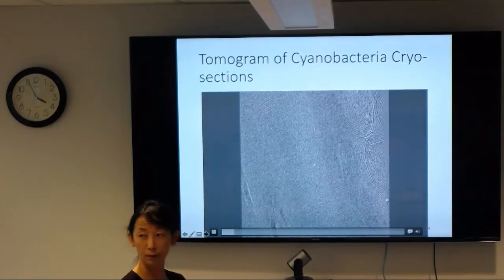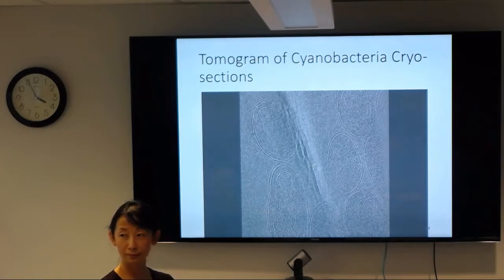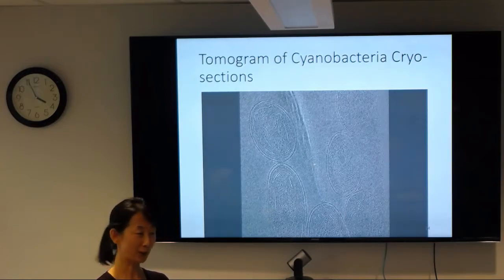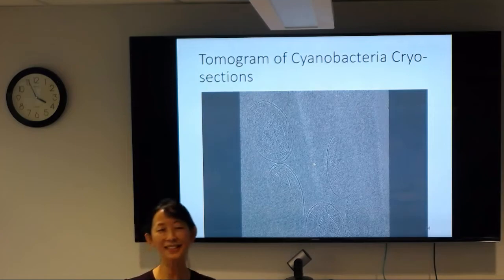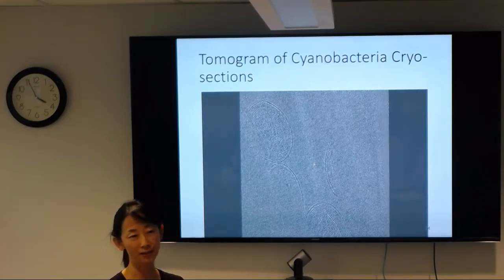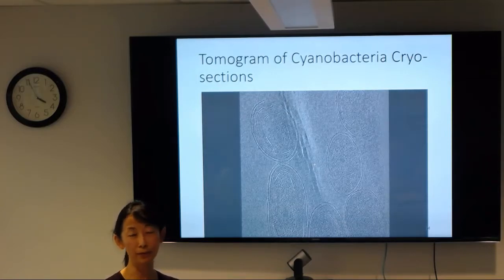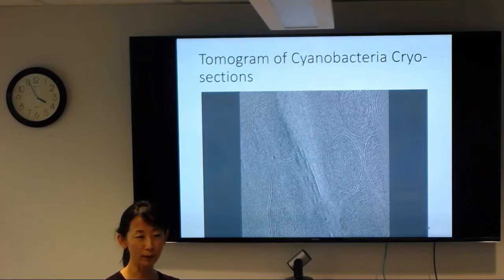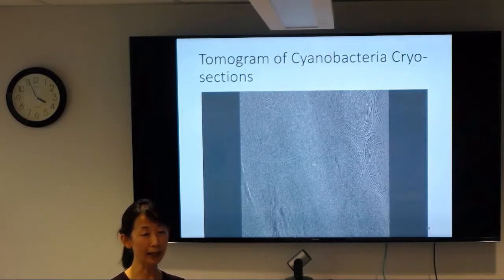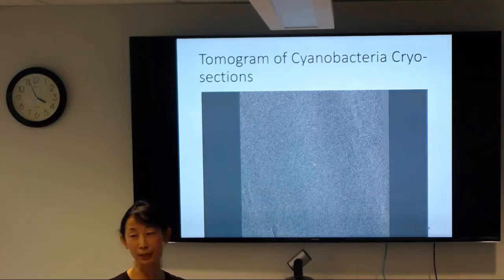You can go down to 50 now. 50. But do you want to do 50? My collaborators do. So this is something you have to, 50 definitely give you very good contrast. You can see everything clearly. But first of all, those ribbons gonna be very fragile. And then you have to make sure it can actually stick to EM grid afterwards. And also the information in that thickness is gonna be limited. So this is a balance you have to choose depending on what you want to do.